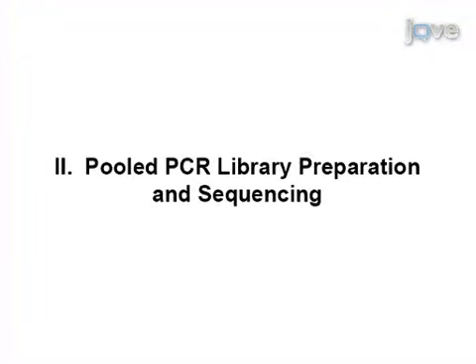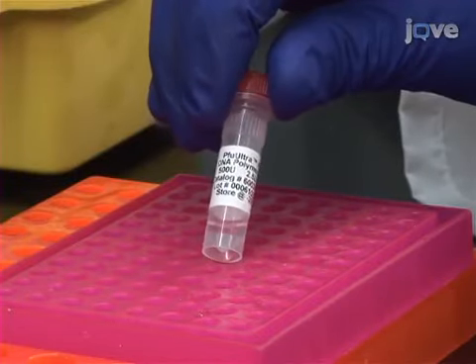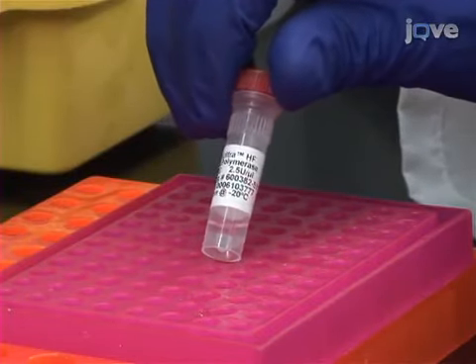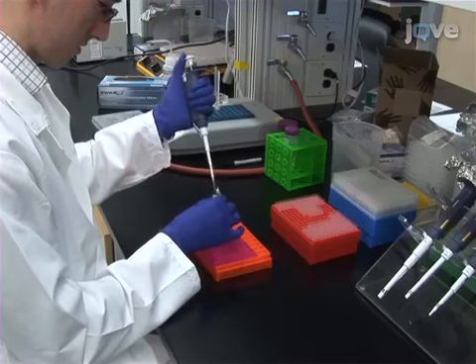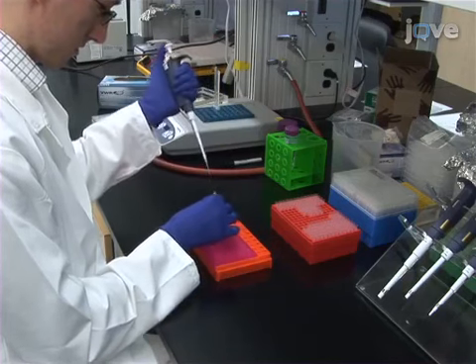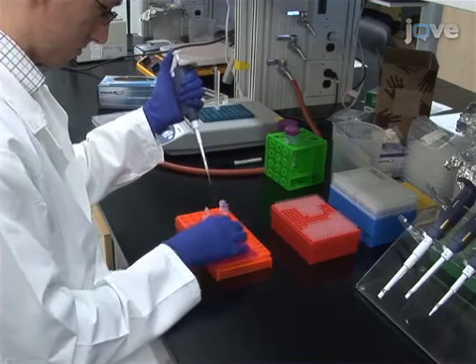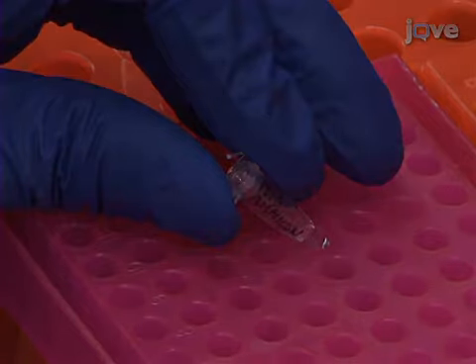Every SPLINTER experiment requires the presence of a negative and positive control to obtain optimal accuracy. Prepare the PCR reaction mix using PFU ultra-high fidelity DNA polymerase. The negative control is a PCR product from any DNA sequence known to be without genetic variation, such as a cloned vector backbone. Here, a 1934 base pair amplicon from the M13 MP18 vector is used.